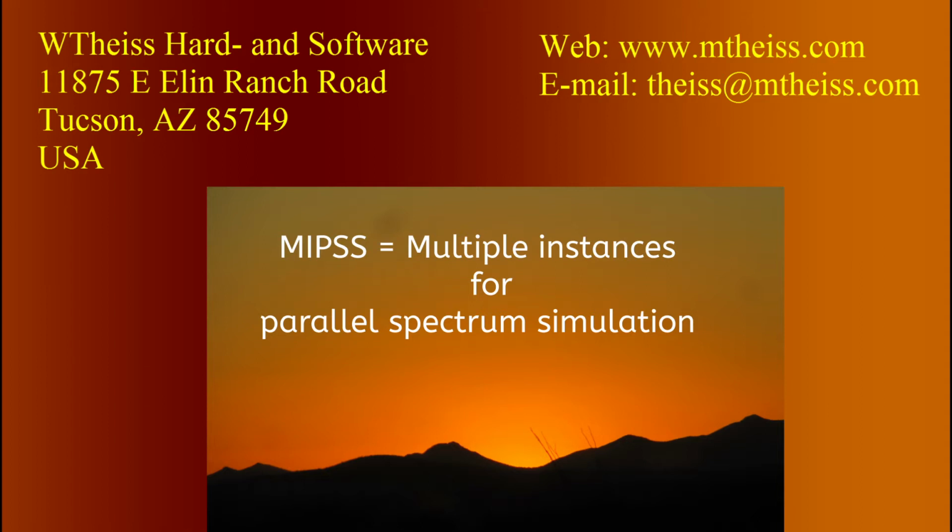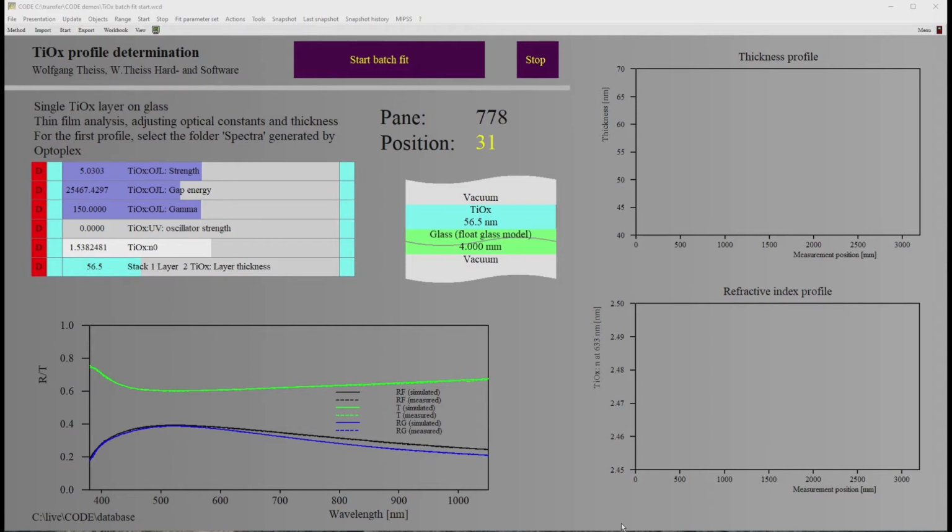You can easily get today computers with 6, 8, 12, 16, or even 32 cores for relatively low prices, and we adapted our software to make use of that. The easiest way to make use of the new MIPSS mechanism is to use it in batch control. I have explained the batch control mechanism in a previous video tutorial.